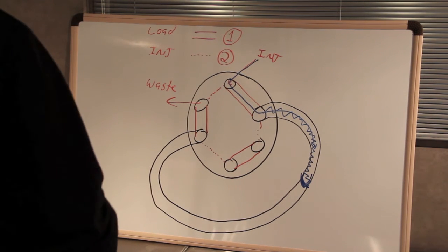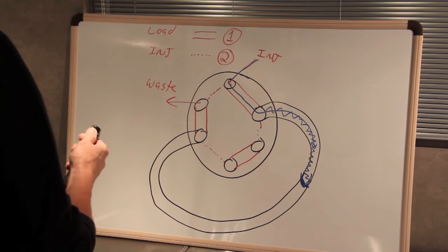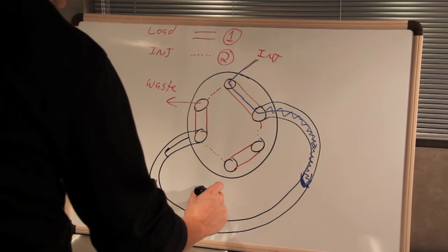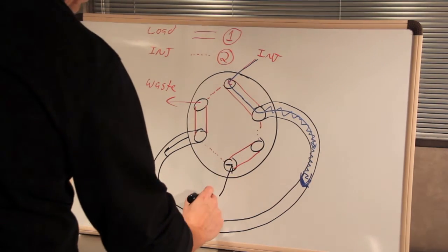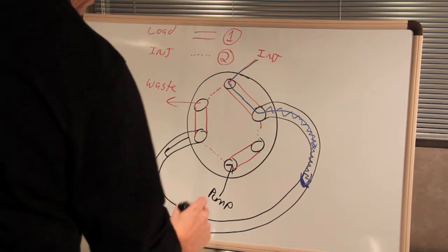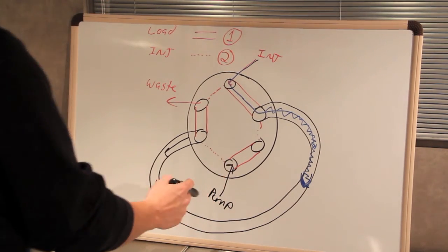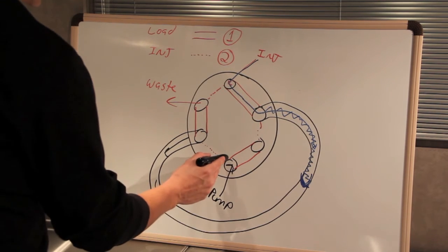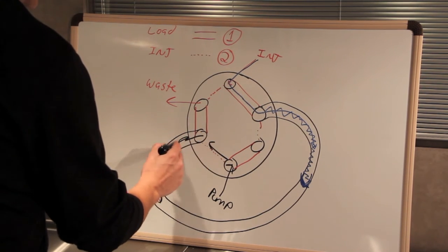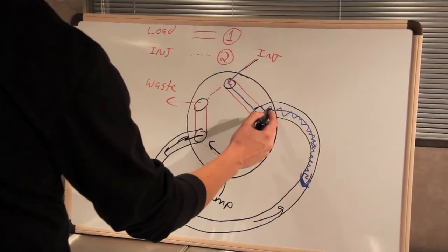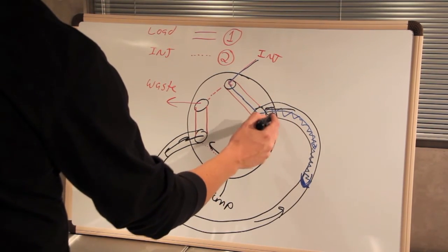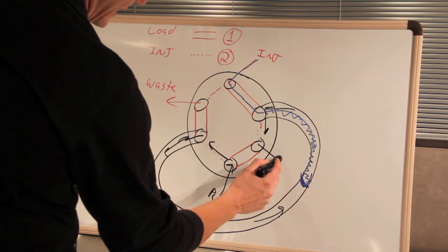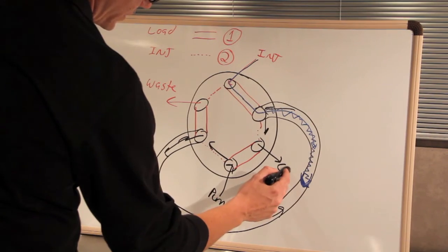So in order to do that we want to make sure that the liquid from the pump is pushed in this direction. How we do that is we hook this port up to the pump. So that when it's switched on or when we go to the inject position the liquid will run this way and it will push the sample plug in this direction through - remember we're going through the dotted lines now - and out this port which is where we want to hook our column up.